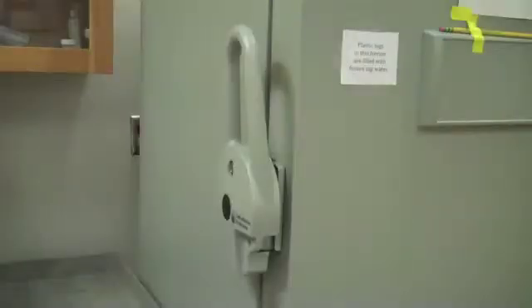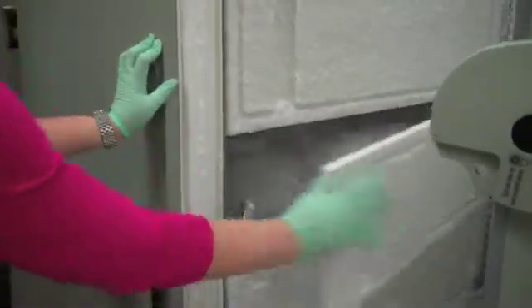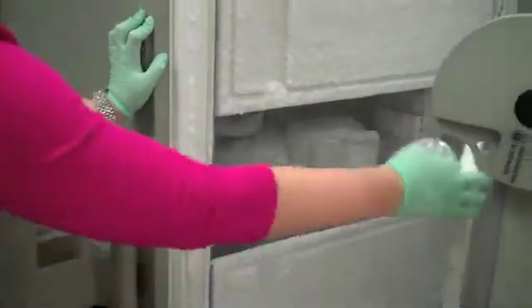The -80-degree freezer is usually used to store samples and blocks. Pull down on the lever to open the freezer and take out your samples. To close the freezer, push the lever upward and make sure it locks into place before you walk away. Before putting anything into the -80-degree freezer, make sure what you are storing is labeled and wrapped in saran wrap and aluminum foil. This way, we avoid contamination of samples.